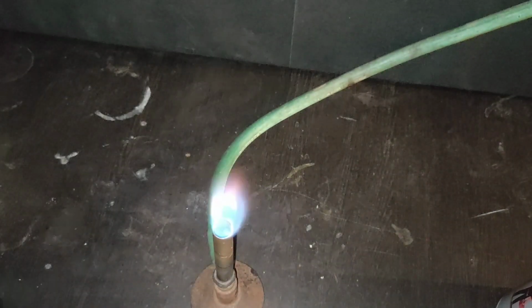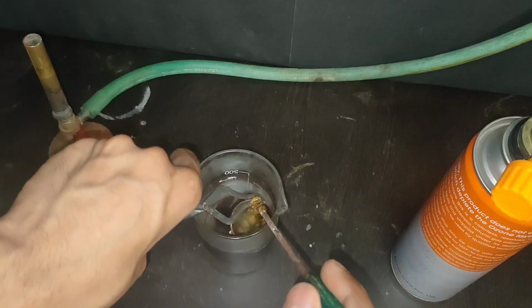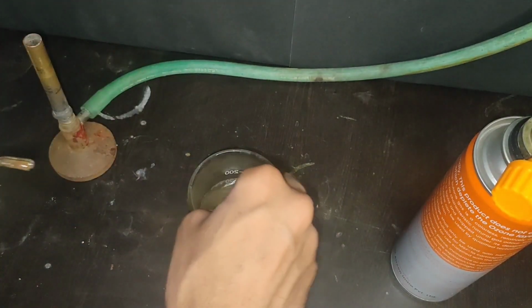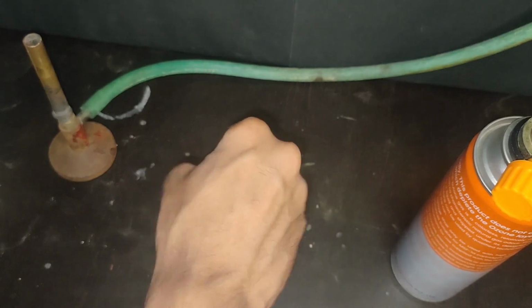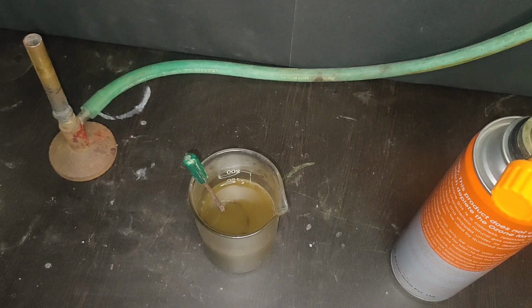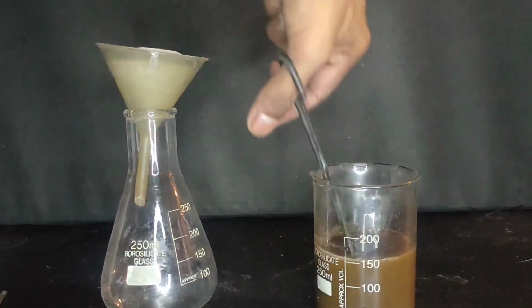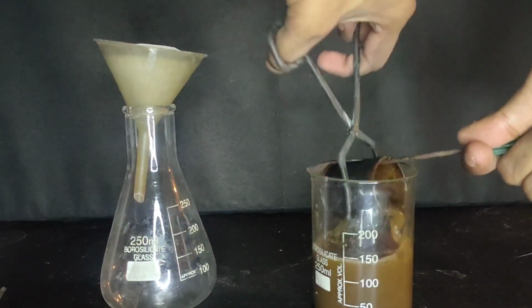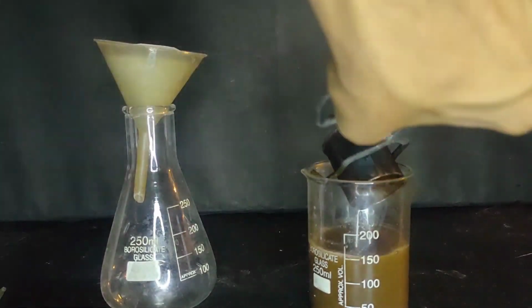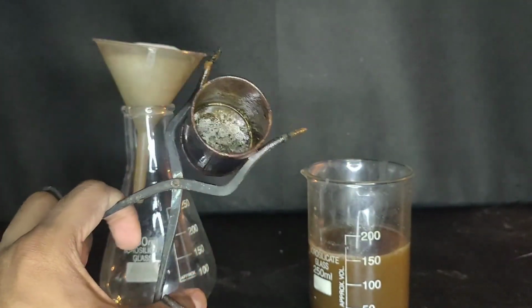When everything melted, I stopped heating and then I plunged the container into a beaker of water. I let it sit, with stirring occasionally, for a few minutes so that everything would dissolve, and then after some time the container was empty, but I could see a precipitate inside the beaker, so I decided to filter this solution.